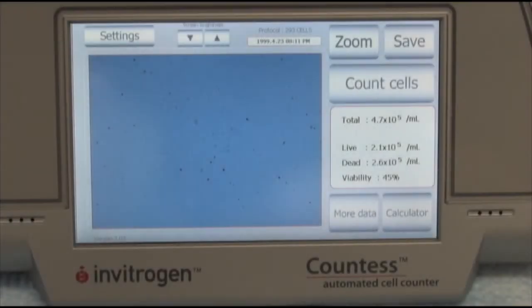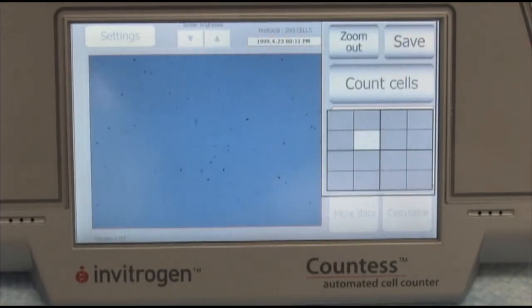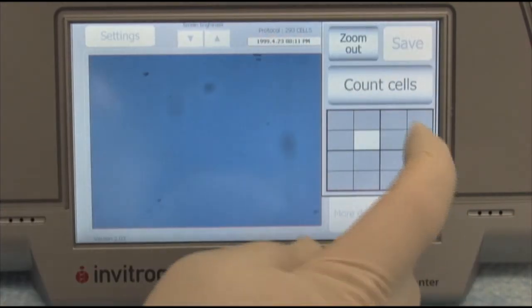After I've inserted my slide, I will hit zoom and choose a quadrant that I'm interested in.